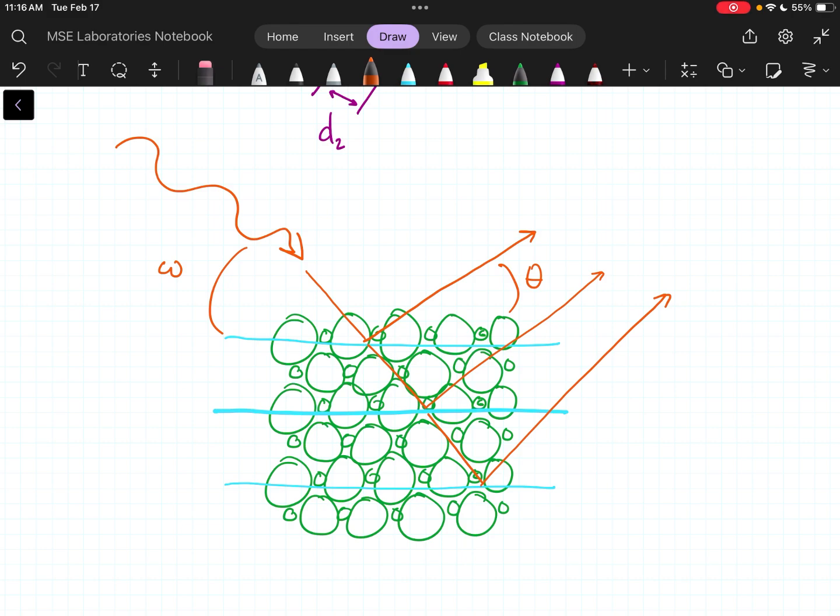Those X-rays then are going to bounce out of the sample at some angle we call theta. Is it all the same theta? Yes, they're all going to bounce off at the same theta. And we're talking angstroms of depth.